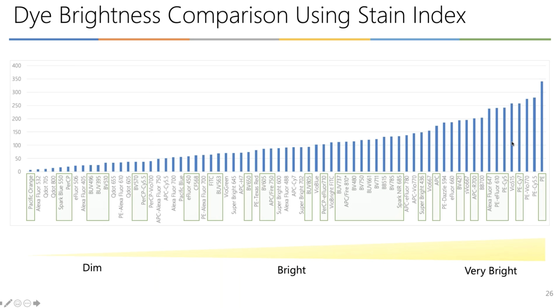In the panel that I am going to design, I am going to be using a variety of dyes that span the whole range of brightness. Why is this important? Using exclusively dyes that are very bright is going to be challenging, as those dyes, I always use the analogy, are like this very loud neighbor that is really difficult to ignore. It's going to be difficult to ignore what? The spread that they're going to be introducing. But we need them.